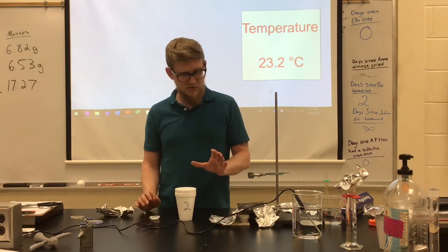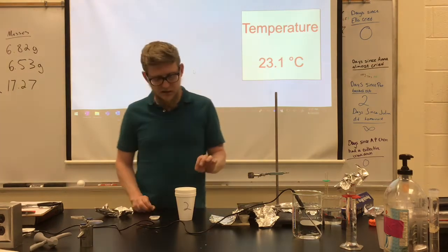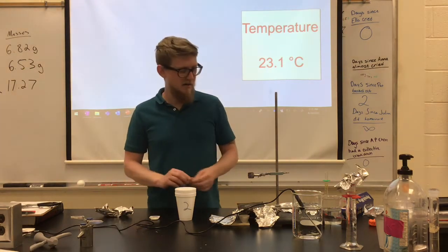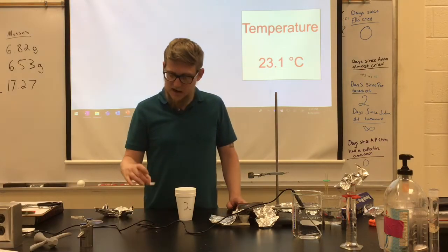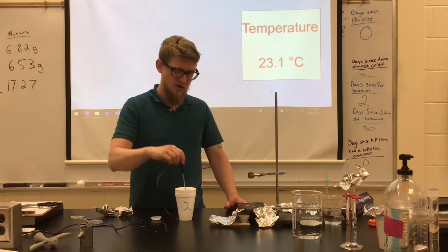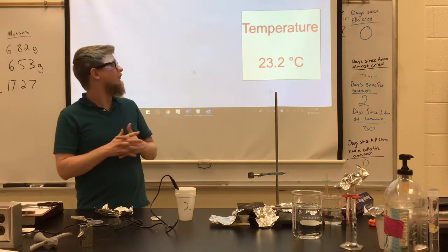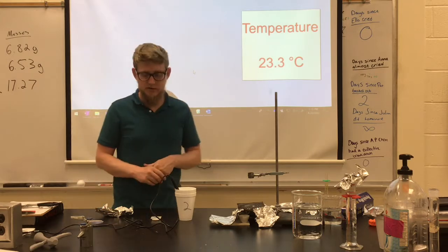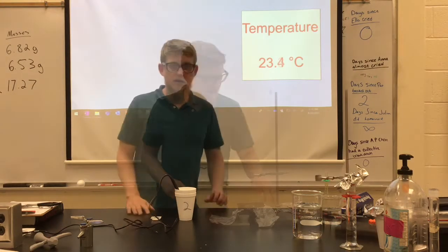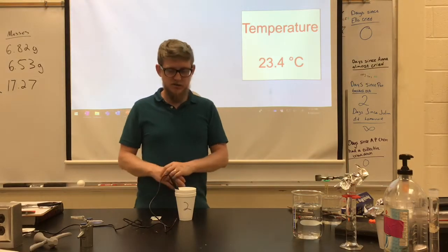All right, now in this experiment, we're going to be measuring the heat of solution. I've measured out 200 milliliters of tap water in our calorimeter. And here I've got 3 grams of baking soda. Okay, so we'll measure the initial temperature, let this sit in the water for 30 or 40 seconds while we clean. Okay, class, this is probably a good baseline temperature for the initial temperature of the water.